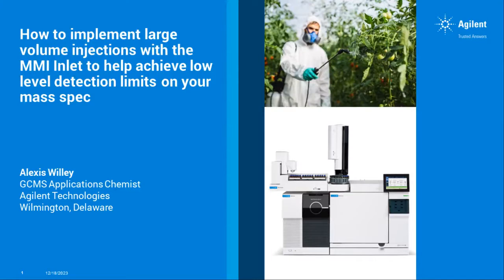I'm Alexis Willie, and today we're going to be talking about how to implement large volume injections using your MMI inlet to help achieve some low detection limits on your mass spec.